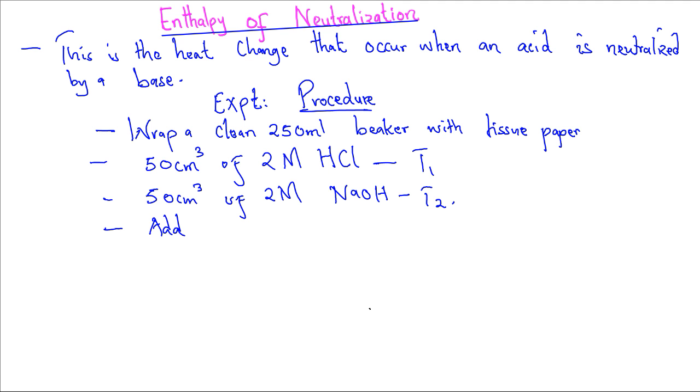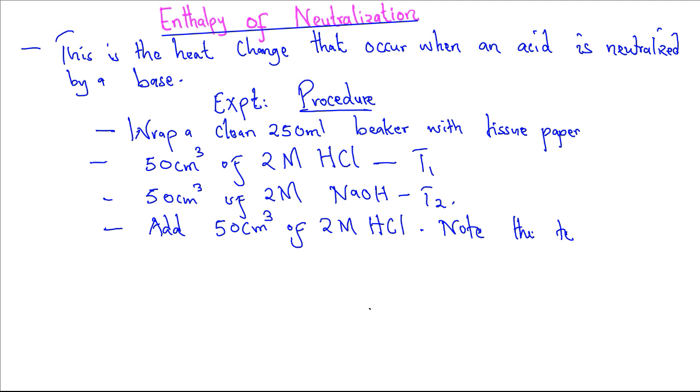Then stir the content, and after that note the temperature and record it as T4.